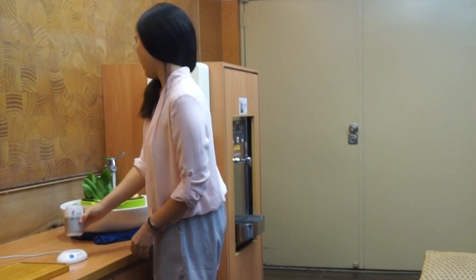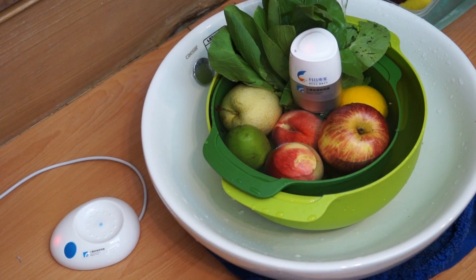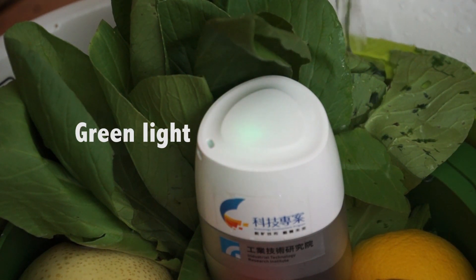Both the sensor device and the battery charging base can indicate the levels of pesticide residue. The red light indicates an excessive amount of residue. The yellow light means that further washing is needed, and the green light indicates that no pesticide or only trace pesticide remains.